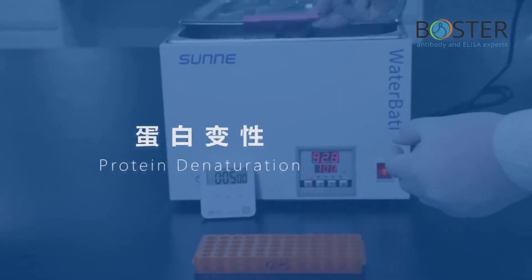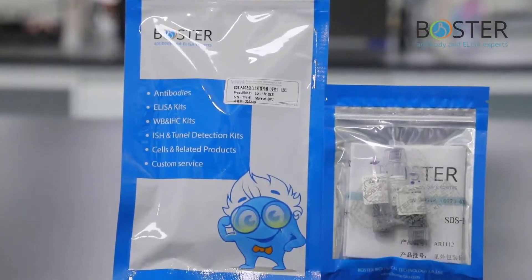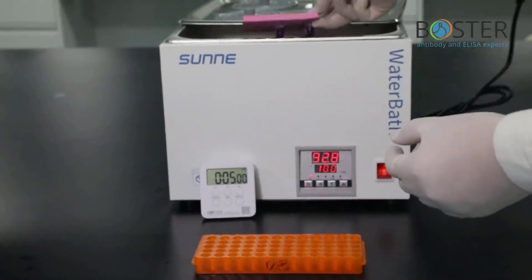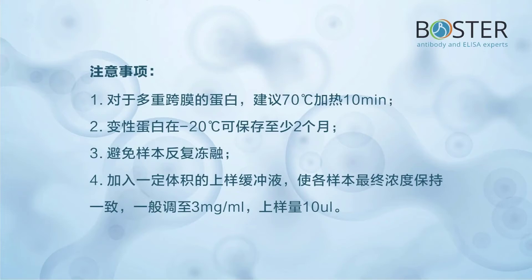Step 4: Protein denaturation. These are the products needed for protein denaturation. Add loading buffer to the sample, then use a 90–100°C boiling water bath for 3 to 5 minutes. Precautions: 1) For multiple transmembrane proteins, it is recommended to heat at 70°C for 10 minutes. 2) The denatured protein can be stored at −20°C for at least 2 months. 3) Avoid repeated freezing and thawing of samples.